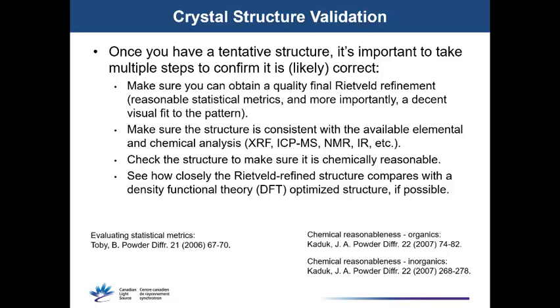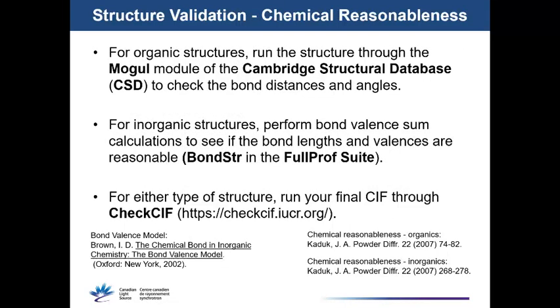And finally, if you have the option, you can compare your Rietveld structure to a DFT optimized structure and see how closely they actually compare. And I'm going to talk a little bit more about this very shortly. So for organic structures, the same way you can set your constraints or restraints by going through Mogul, you can put your final refined structure through Mogul, and it will tell you if there are any bonds or angles that look out of place or unusual. So that's a good final step to check your actual organic structure.